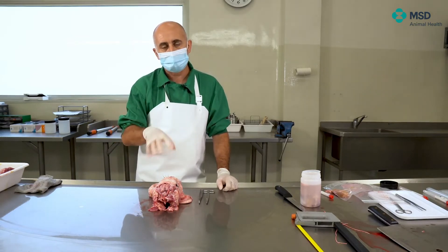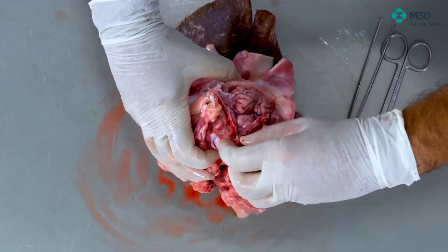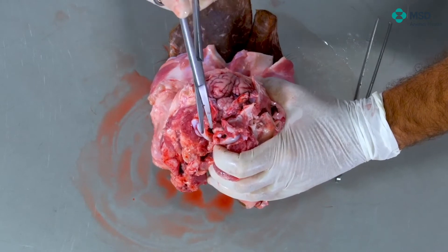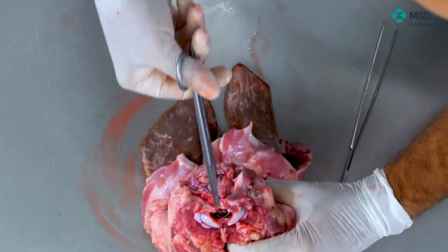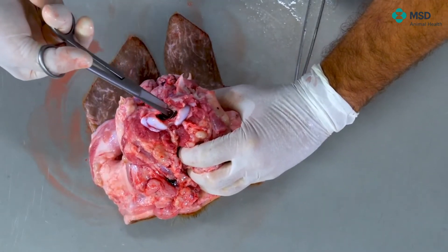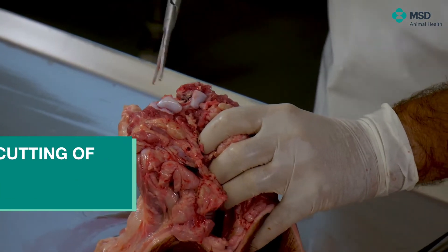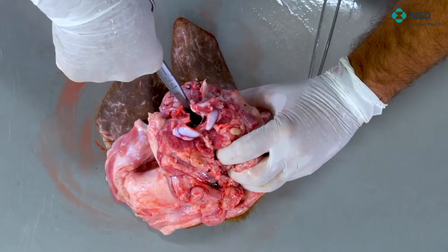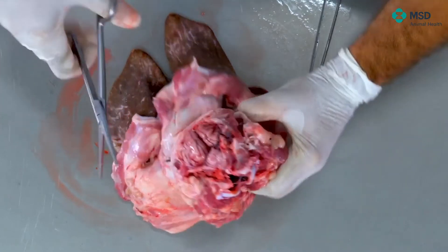The next step is to remove the brain from the skull. For doing this, we will need to cut the cranial nerves. The brain is attached within the cavity by the cranial nerves, which are difficult to see but are always inside. Here we have the foramen magnum, so we will cut inside at both areas — right and left — in order to remove the brain without causing damage. When this is sufficiently cut, we remove the whole brain in perfect shape.